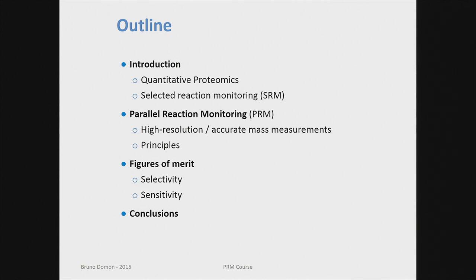How the talk is structured: I will use this morning session to discuss more the basics and the principles, and as we have a second follow-up session just after lunch, there I will show a little bit more how we apply PRM and move it to the next level, what we call PRM version 2. It has as a goal not only small quantitative assays, but large scale, looking at hundreds or even thousands of peptides in one single experiment.